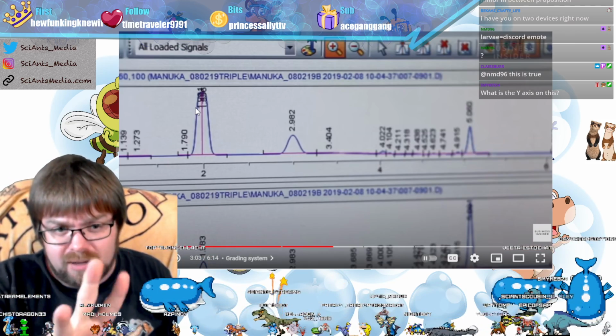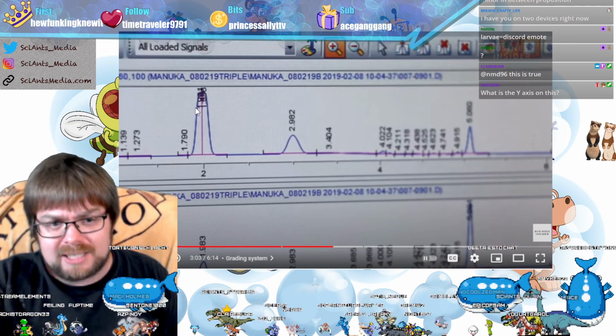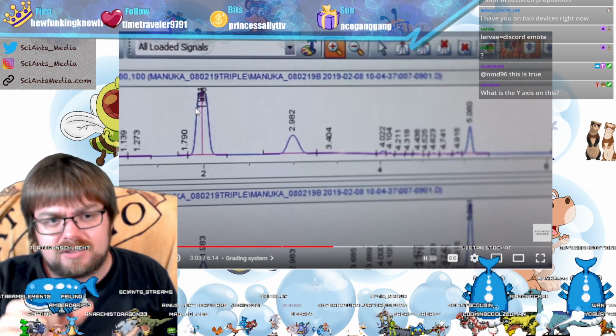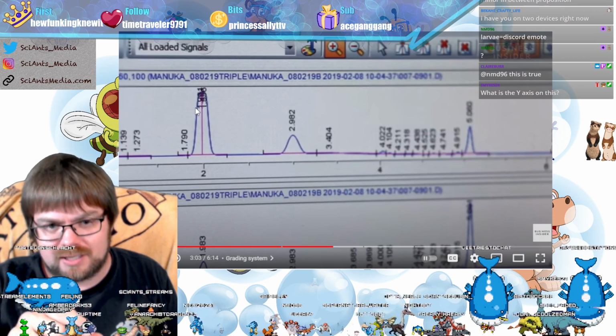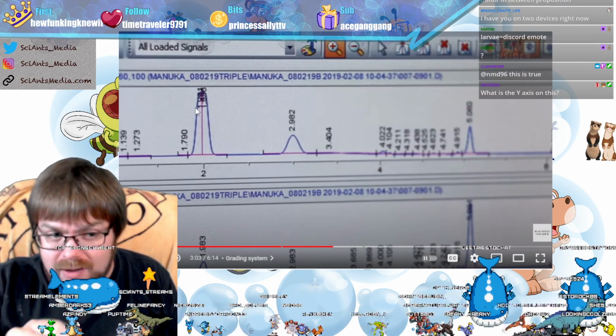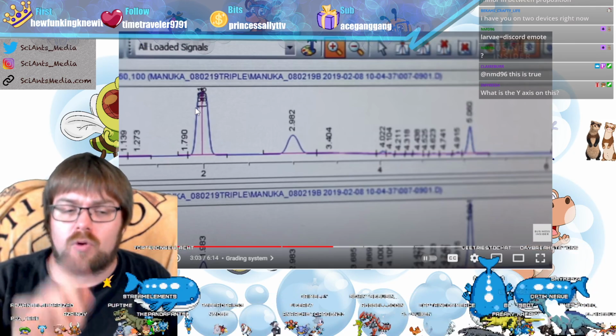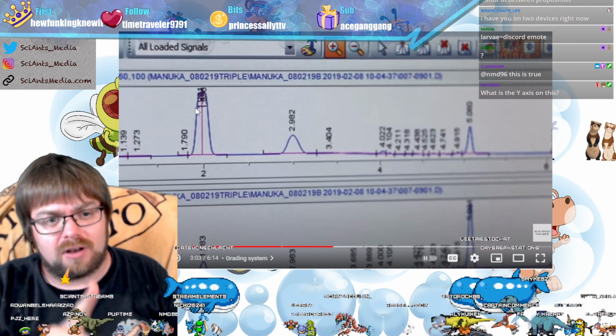For these guys, when they're looking at the honey just to look at product quality, they mentioned those 3 different components. They're only running the mass spectrometer on a very, very short window of time to look and see if those 3 things are present. To actually analyze and see what all is present, you have to run the sample for much longer, and you have to do many more samples, because there's always also background noise.